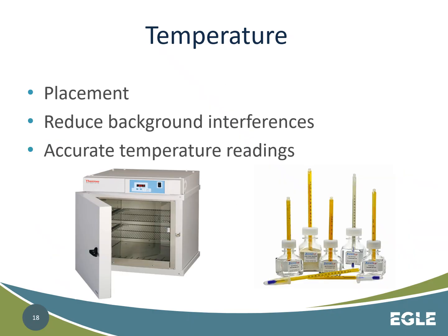So with temperature, we're going to be looking at temperature with calibrated thermometers, and typically thermometers have to be calibrated at least once a year. So if you're not going to check them for calibration or do the calibrations yourself, you can send them out to be calibrated, or you can simply buy new ones. A lot of people choose to buy new ones.